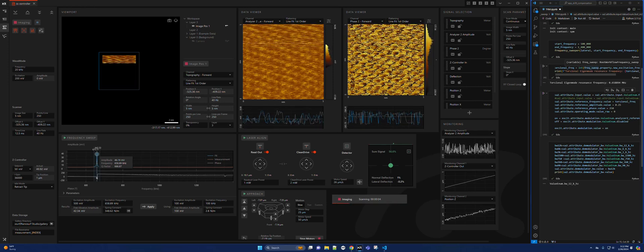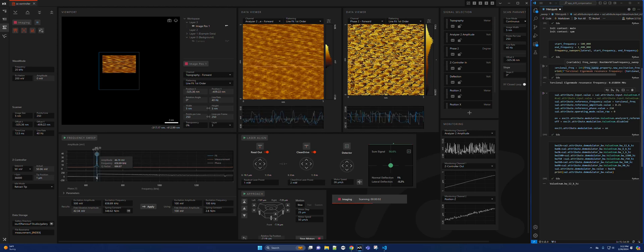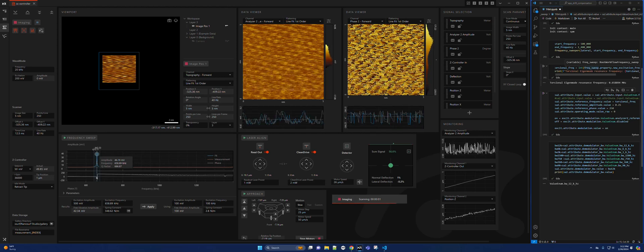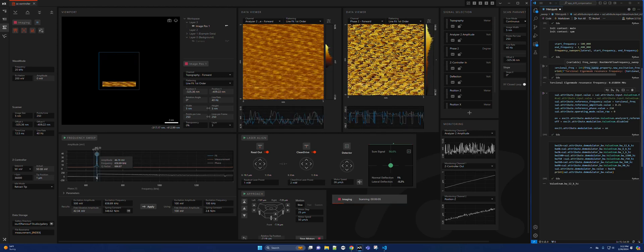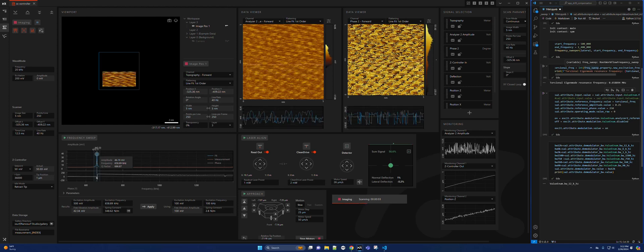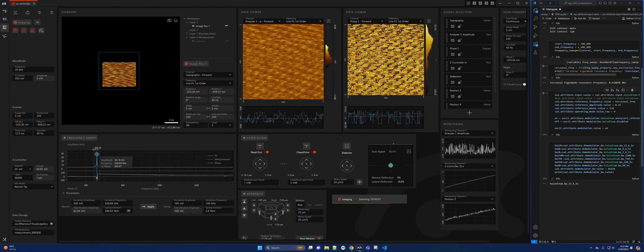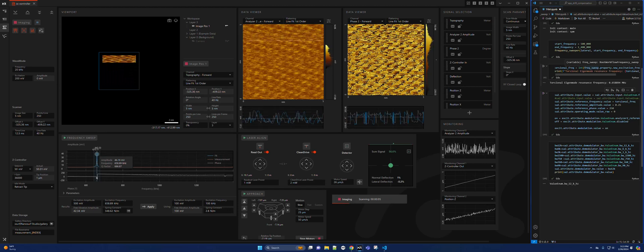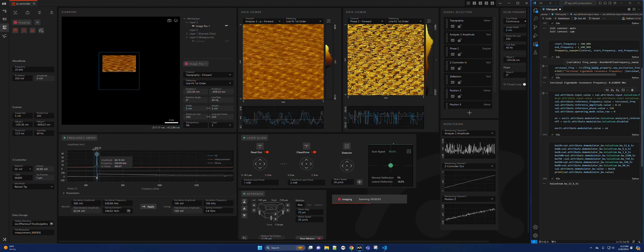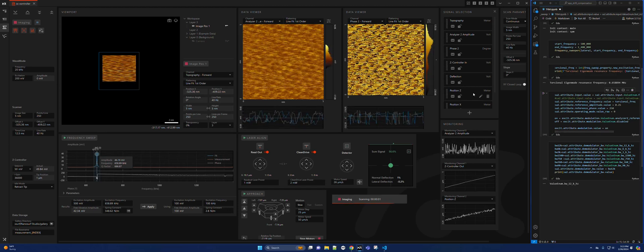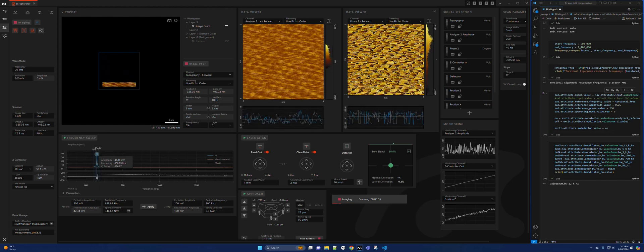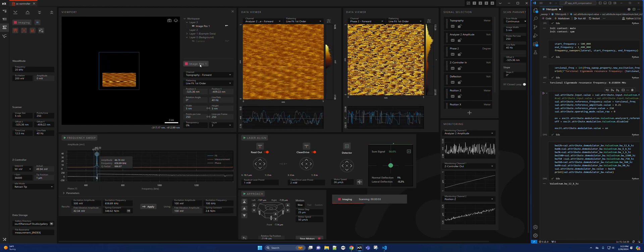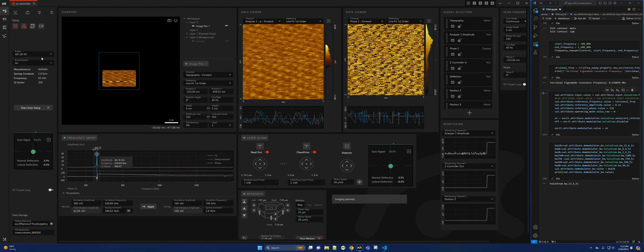This is a demo of torsional resonance mode. At the moment I am imaging a 5 by 5 nanometer scan, probably around 10 by 10 if you factor in the XY positions. As you can see, we can make out the atomic lattice of HOPG in this image. I will show you how I set this up.